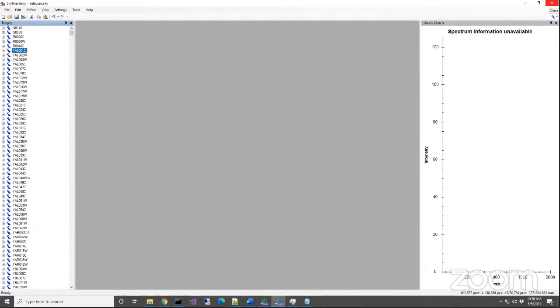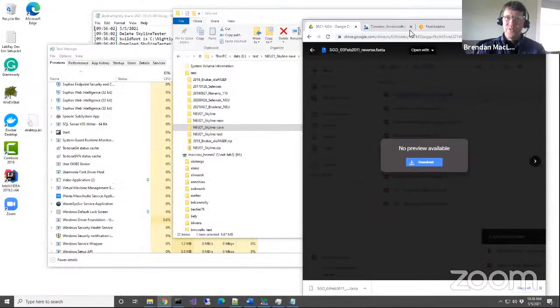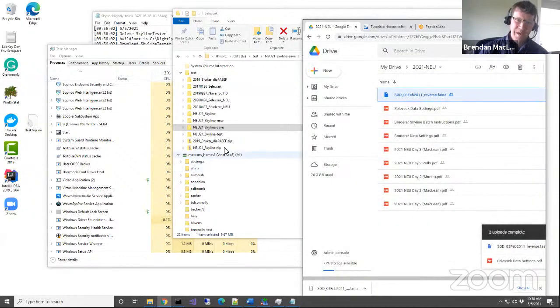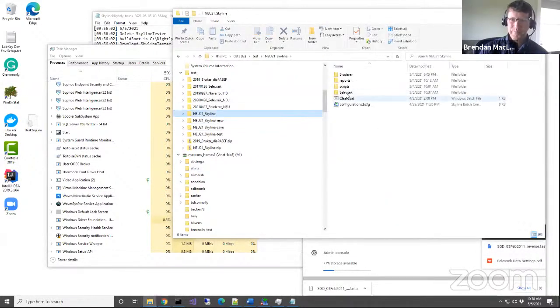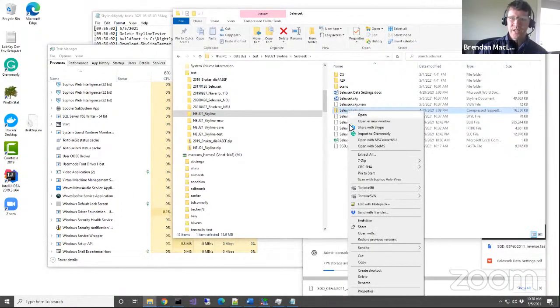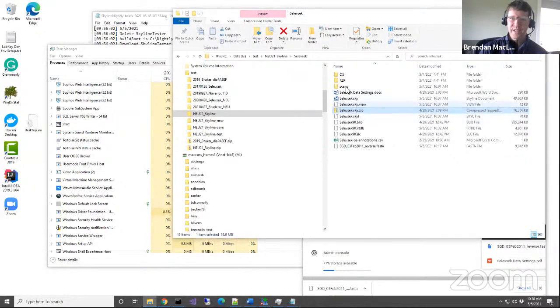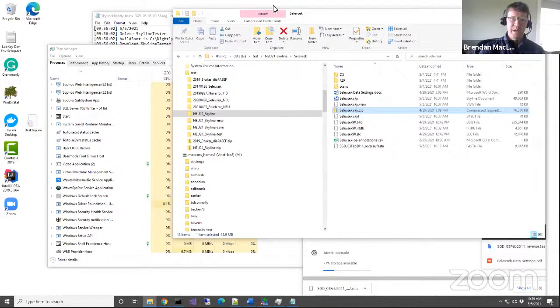I'm going to close Skyline on my computer, and hopefully people are relatively caught up. And if you're not, and you want to go onto the Skyline Batch, again, you can go here. If you're behind, you just didn't follow along at all, and you want to get to where you can run these Skyline Batch things overnight, go ahead and use this extract all to set yourself up. And now I'm going to stop sharing my screen, let Ali share hers, and she's going to take you through the next step.